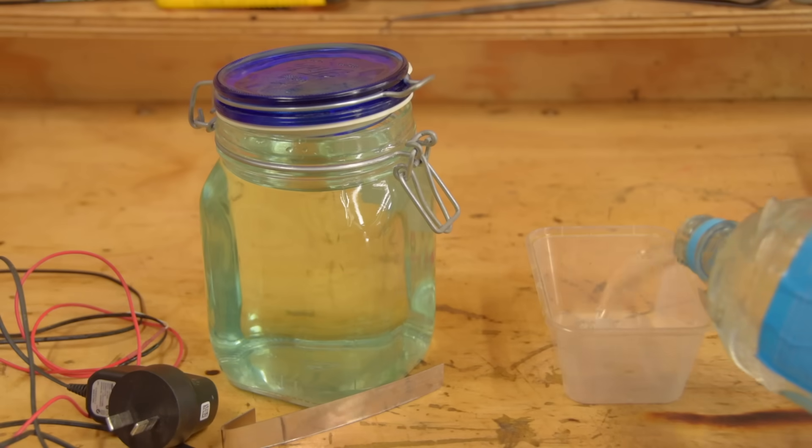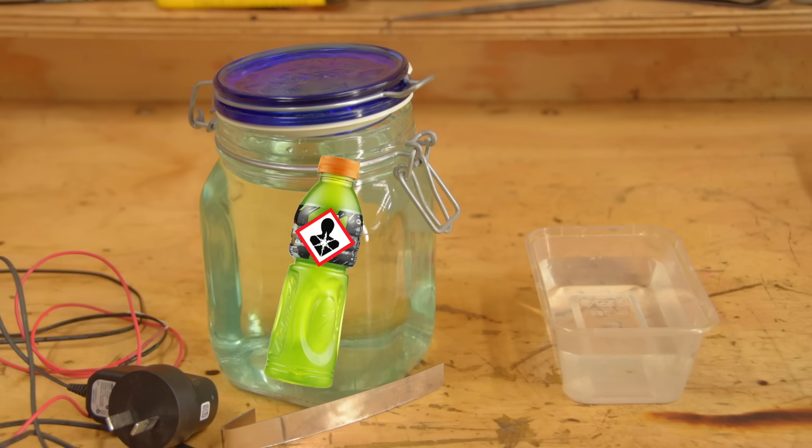This is what your nickel electrolyte should look like after an hour or two of brewing. It should be a definite green, like delicious watery Gatorade. It will get more concentrated as you use it, so don't worry too much about how green it looks to start with.